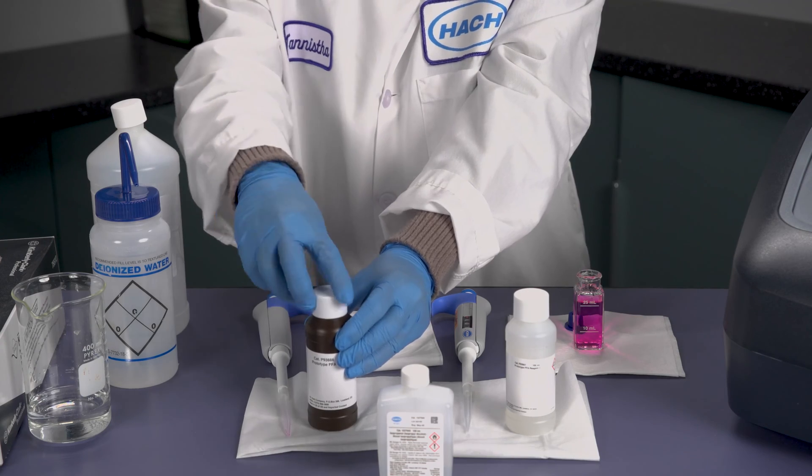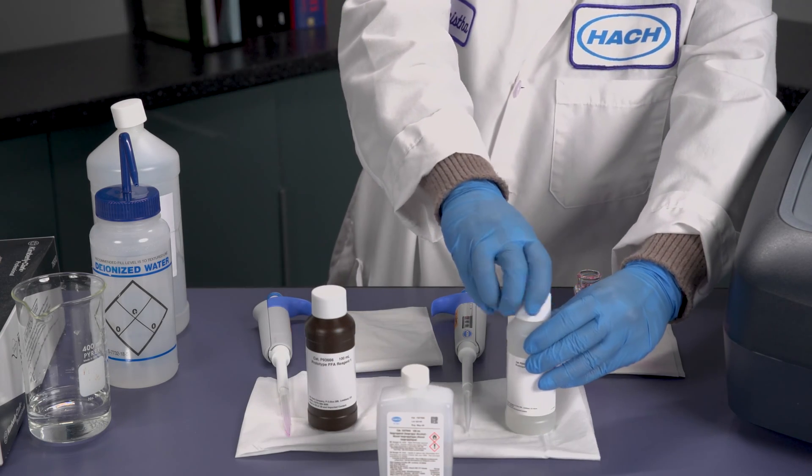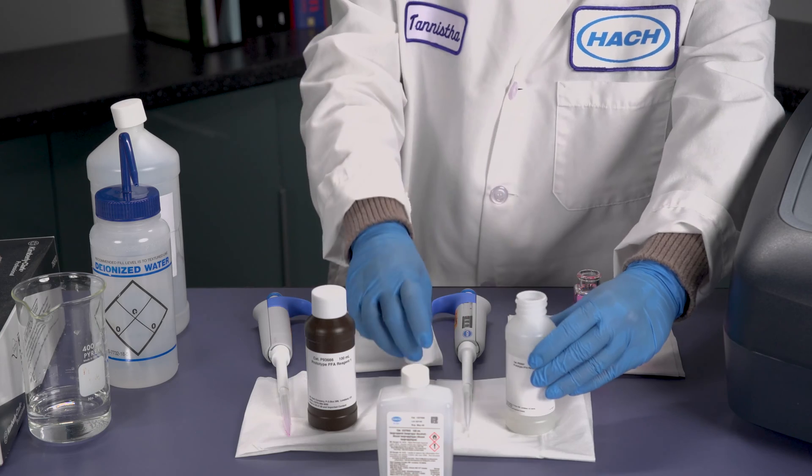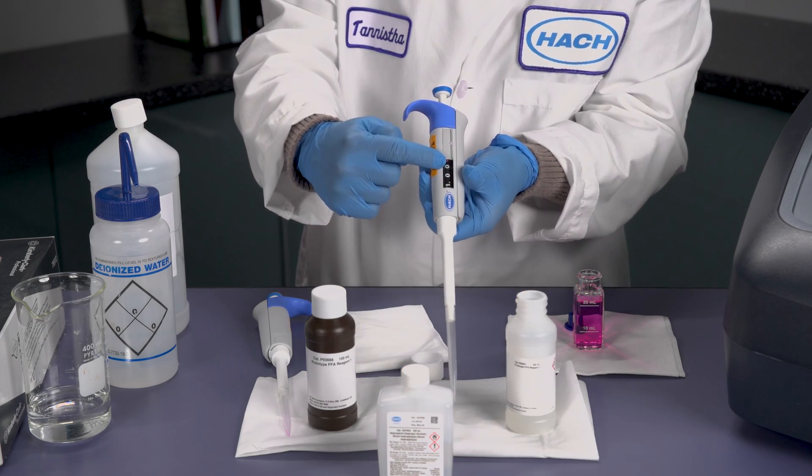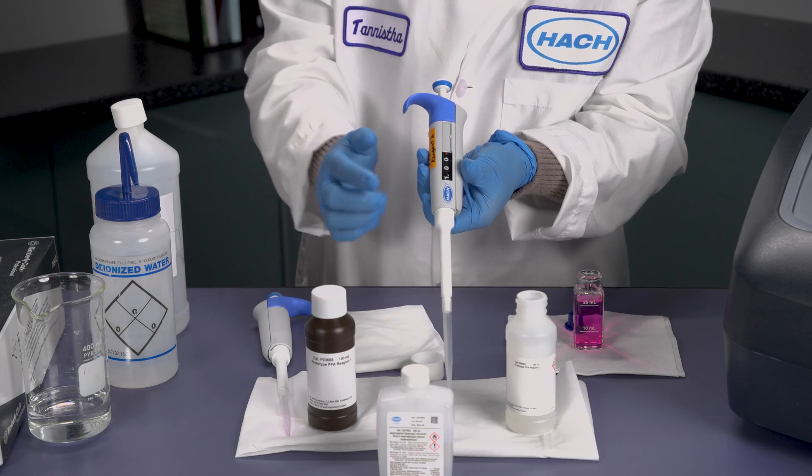Next, we're going to add film forming amine number 2. Again, it's very important to use separate pipettes for this method. Set this at 1 ml as well.